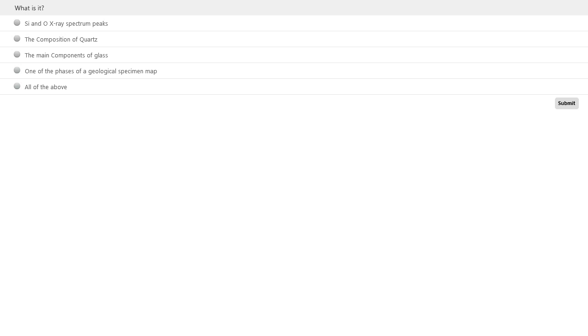What is it? So if you could take a moment to select one answer. And please note that you have all of the options there, including the bottom. We've got a bunch of options for you. And then just click on your answer and then the Submit button. I will give you all a moment, and we'll see how the results turn out in the next slide in just a moment.